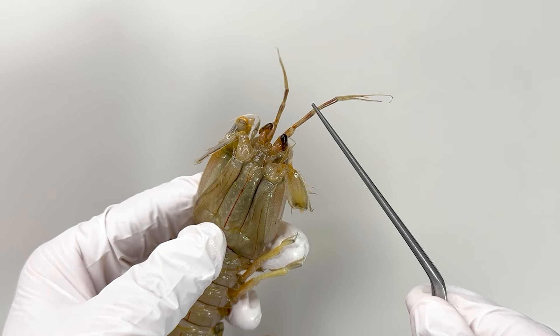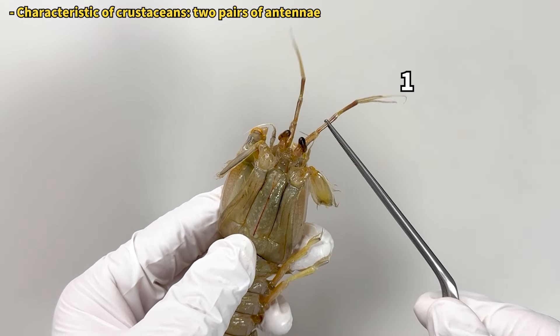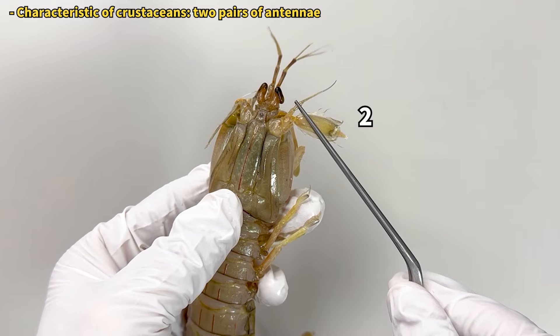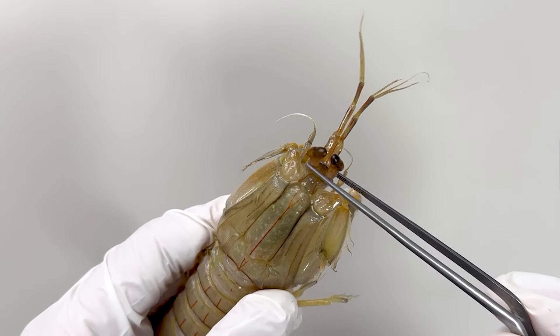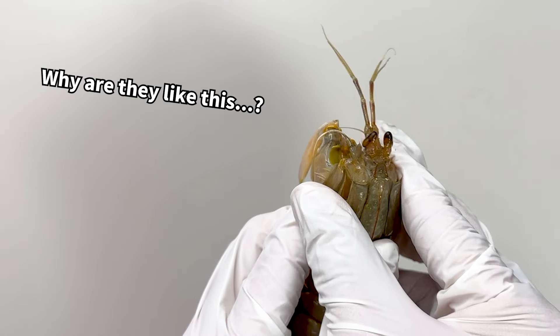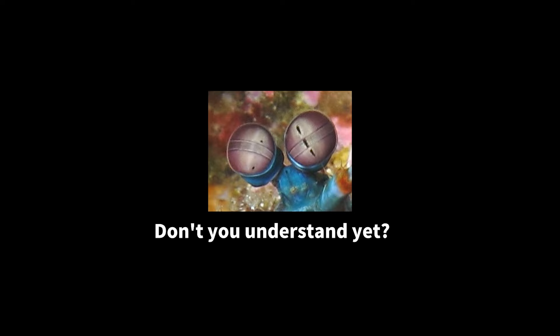Let's continue observing the mantis shrimp. Upon closer inspection of the mantis body, you'll see two pairs of antennae at the very front, which serve as sensory organs. And below these are the oval-shaped eyes. It's said that arthropods have the most complex eyes in the animal kingdom, but the reason behind the unique eye structure of the mantis shrimp remains a mystery.